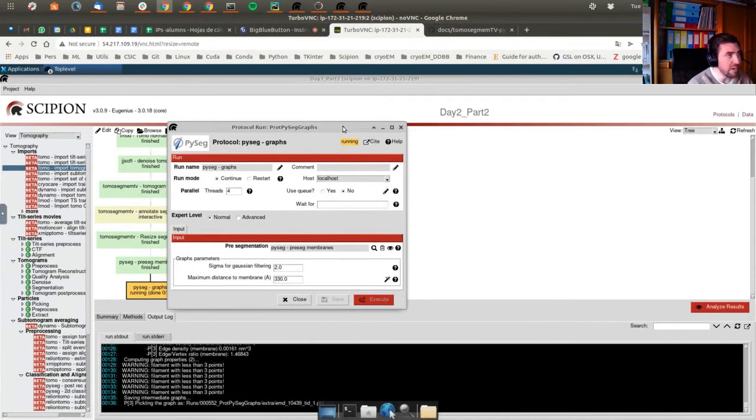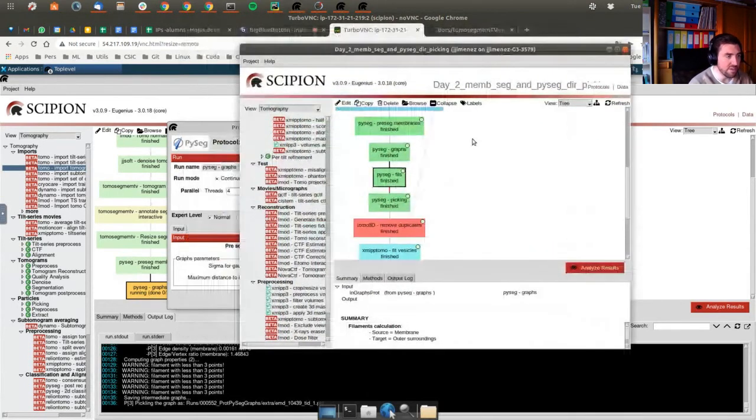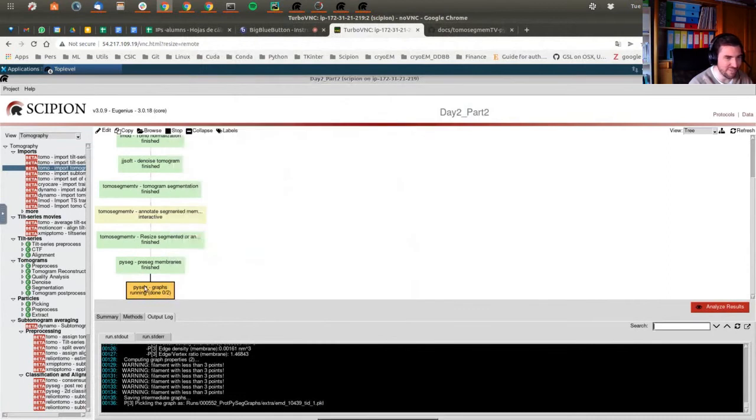Yeah, okay. I have them. I have the project here in my local machine. And the maximum distance. Okay. Yeah, it's the same, and it took me 23 minutes, and here it's 37 something. This is why I got completely surprised. I don't know why it's taking so long. I don't know, probably the frequency of this computer is slower?